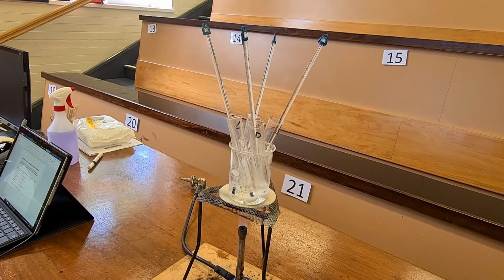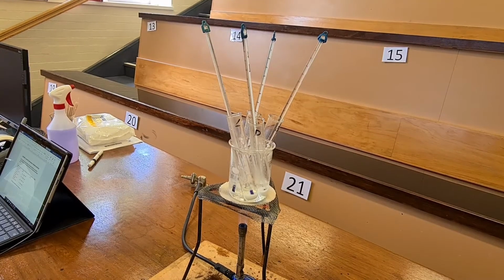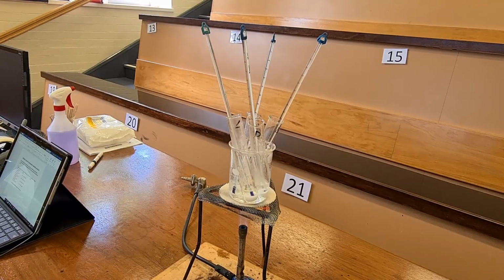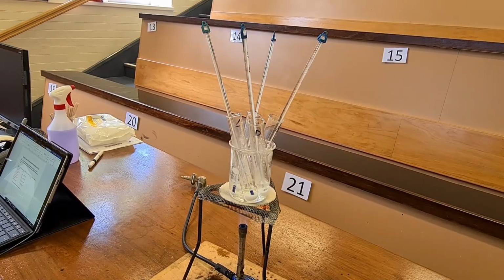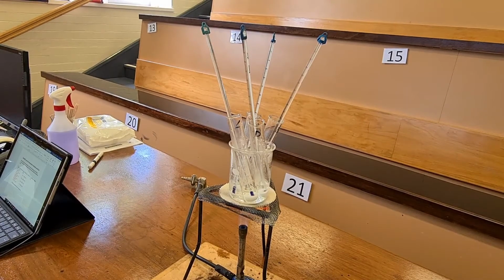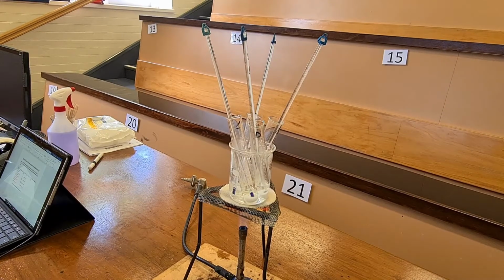So I've got 4 of those test tubes in water, and the water's warming up, and as the warm water bath warms up the 5 centimetre cubes of water, I'm hoping that dissolving of that quantity of ammonium chloride will happen. Now let's take you through some calculations.